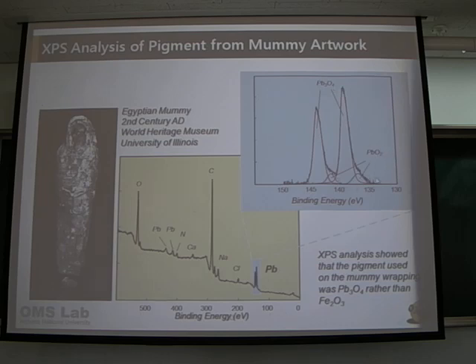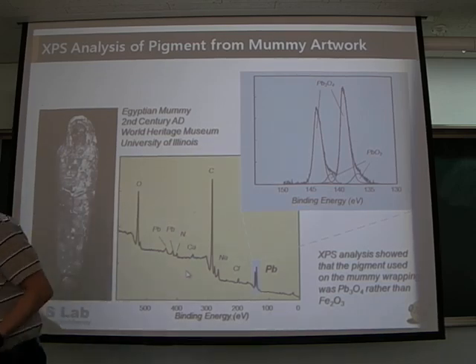That means it also contains Pb3O4. So in this case two types of lead compound are here. If we draw the high resolution, but if we consider only the survey data, we cannot confirm what type of lead is contained here. We can just know that this compound contains lead, chlorine, sodium, carbon, calcium, nitrogen, oxygen.